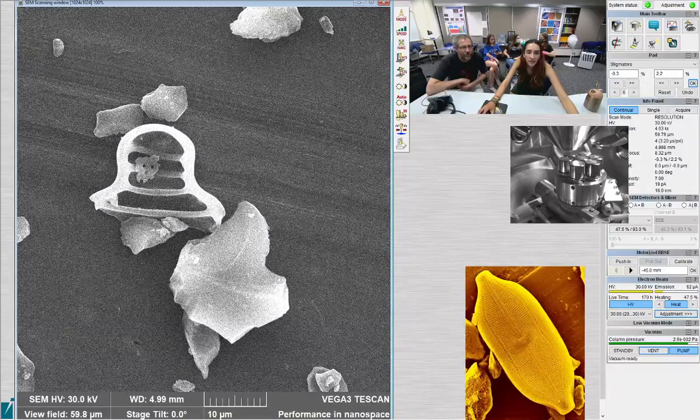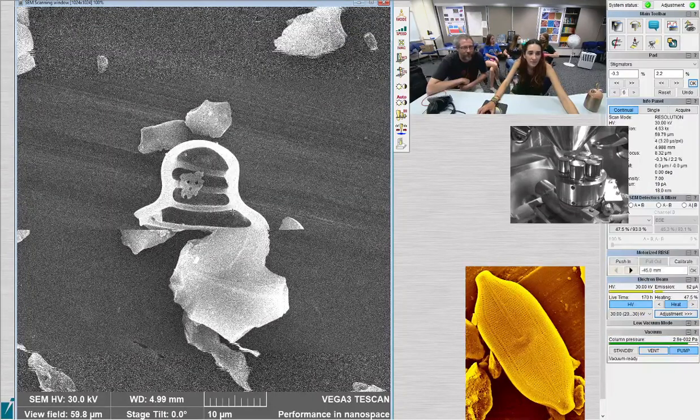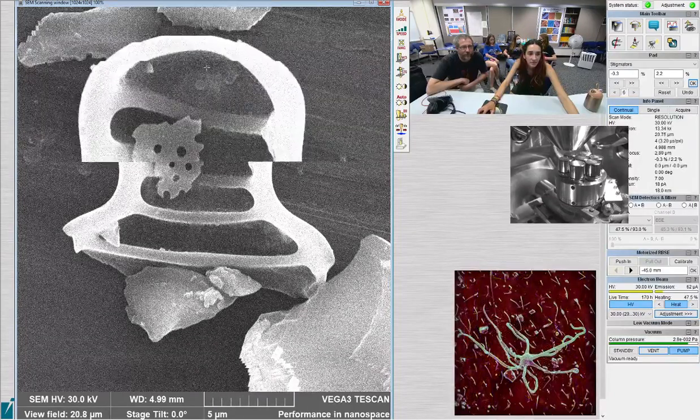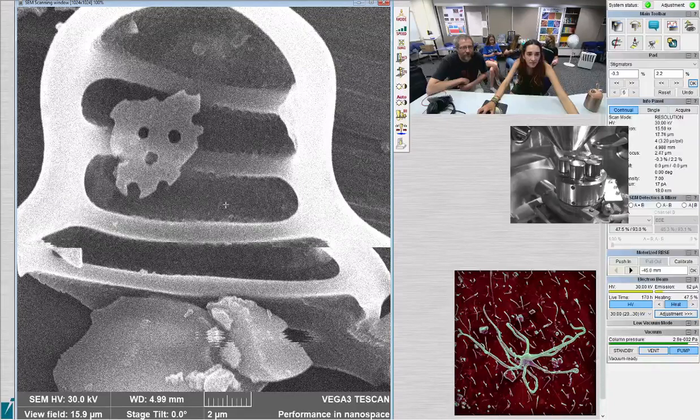It's like a face. It's just a piece of something else on it. Because it went through all the boxes. You can see the apical pore fields. Six is all lined together. So if you just want to add a few more to those, then we can do the rest of them. Just put those in boxes.